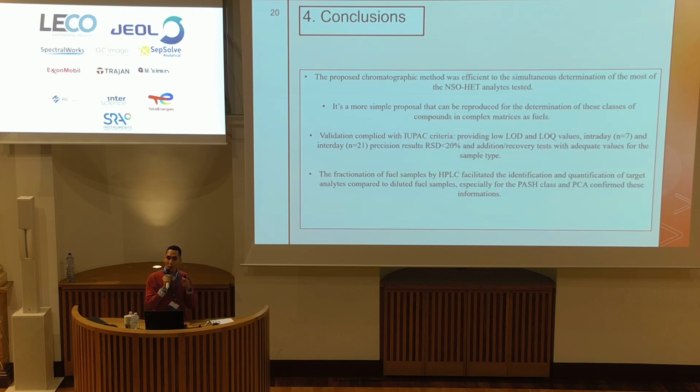So, as conclusion of this work, the proposed chromatography method was efficient for the simultaneous determination of most of the NSO compounds tested. It's a simpler proposal that can be reproduced for the determination of these classes of compounds in samples such as fuels.